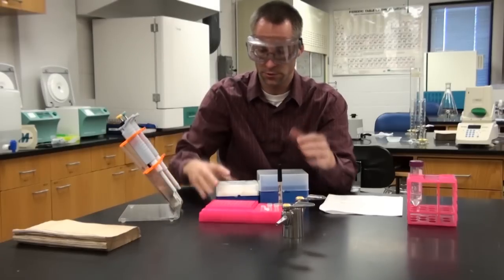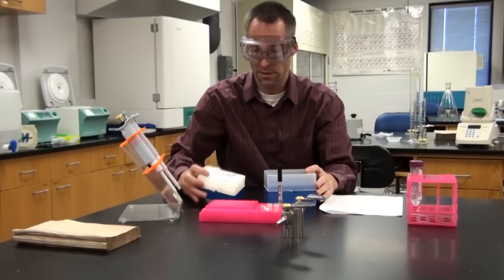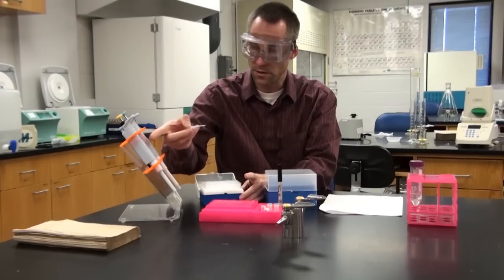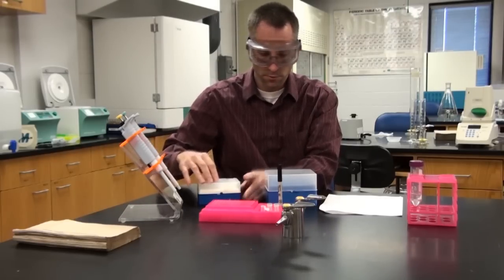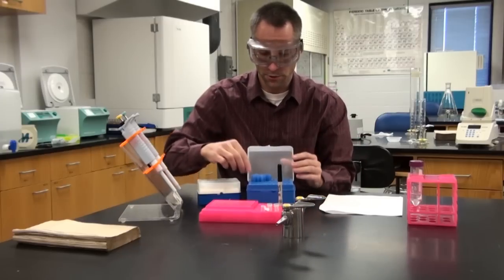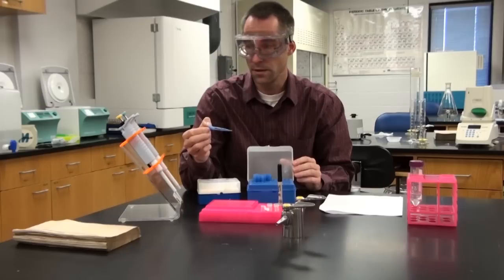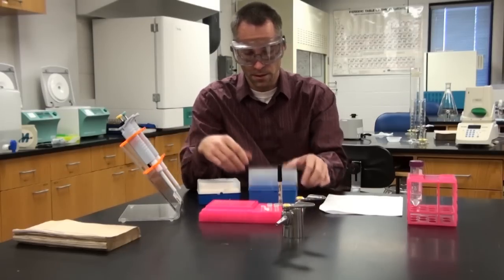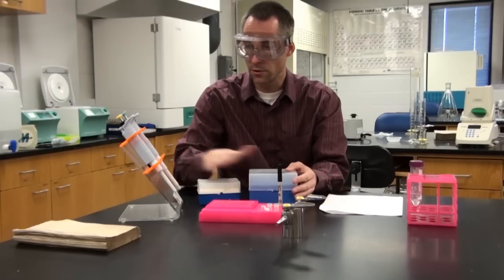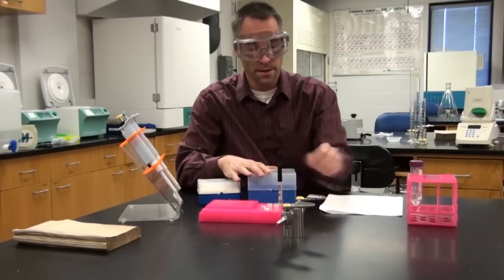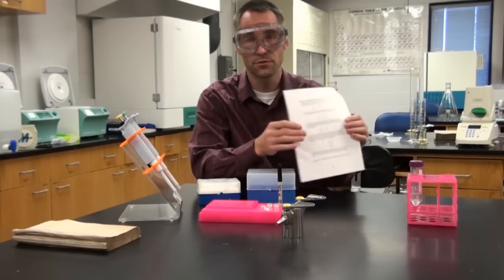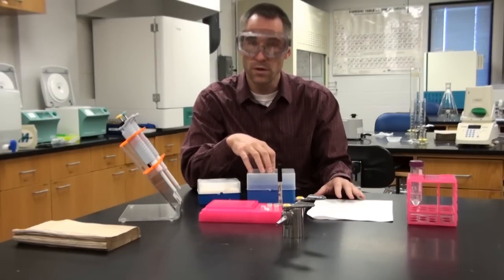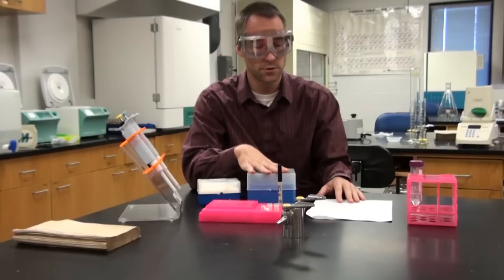With those, you should have tips. There should be a box with small white tips that look roughly like this. That will be used on the P20. You'll also have a larger blue tip that will be used for the P1000 or the larger one that will measure 1 mil. Always have tips on it so you don't contaminate the actual instrument and as always have the instructions so you can check the boxes as you go and always read through them completely so you know what to expect.